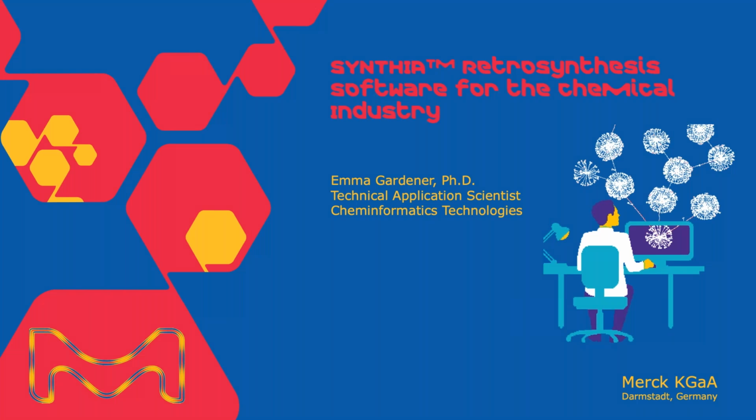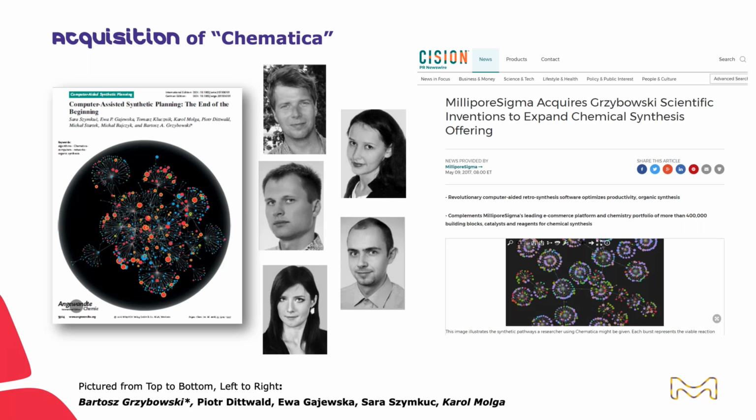So just to get started, I do want to briefly introduce Synthia, which was actually a software originally known as Chematica. It was developed by an academic group led by Professor Bartosz Grzybowski and his team of graduate students. There were quite a few publications about this, so if you've seen any of those publications referencing Chematica, know that this is that same technology. We actually acquired the software back in 2017 and are continuing to work with Professor Grzybowski as we continue to develop and commercialize the software now.